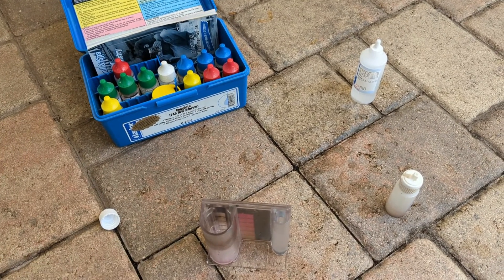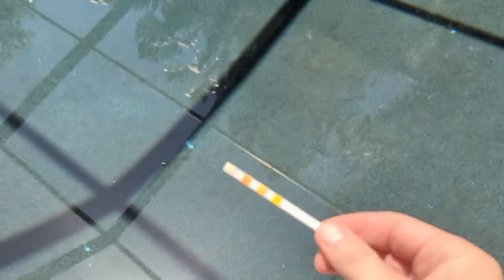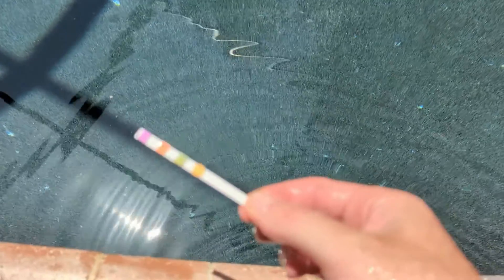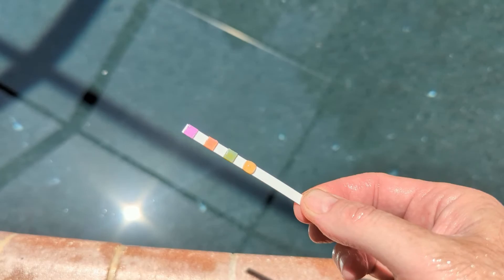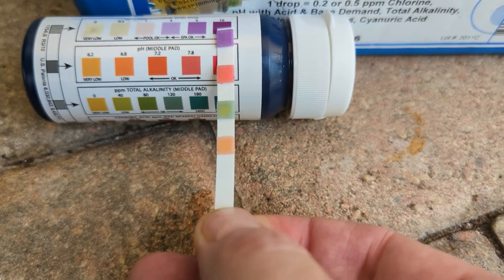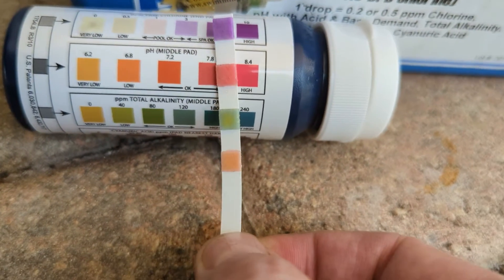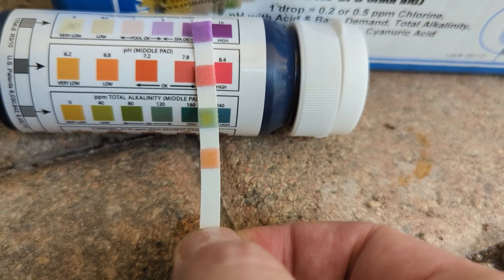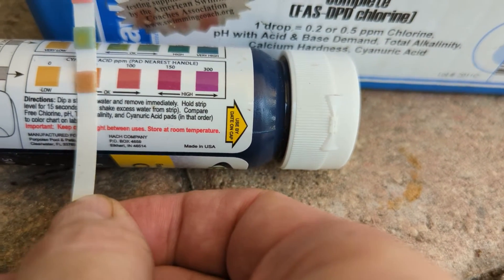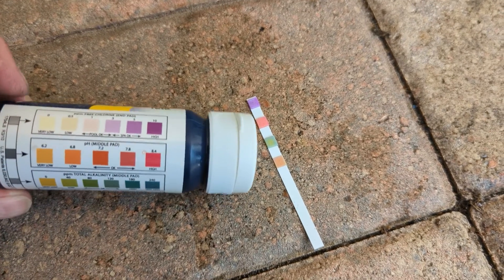Now let's go ahead and test that against the test strips. Magic test strip in focus right there. We have a brand new one — dip it in and keep those little dots of water on there, let it sit for just a few seconds. Chlorine was really high at 10 — and that looks pretty dark, darker than that reference. We're going to call that a tie. For pH, that was pretty high too, and it falls right in there — calling that about 7.8 to 8.0 as well. For the stabilizer, it looks about right in there — it says 30 to 50. Do you think these are fairly accurate? I think they are.